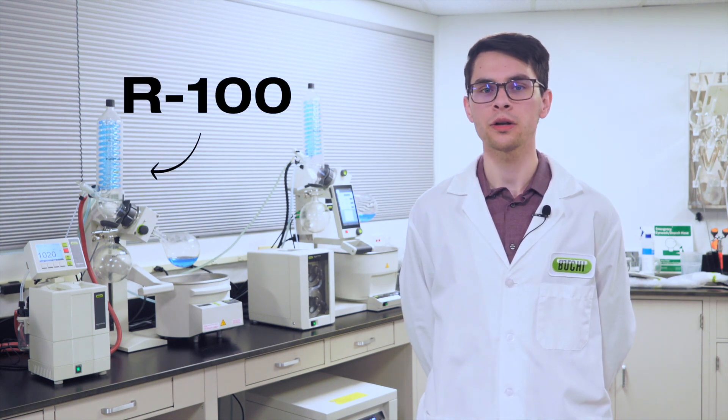Since its introduction, several generations of the rotovap have been developed to meet the needs of researchers and flavor enthusiasts alike. Currently, Buki offers two models of bench-scale rotovapors, the R100 and R300.